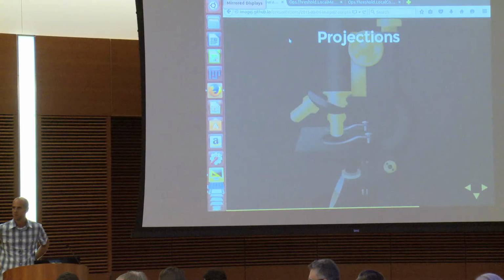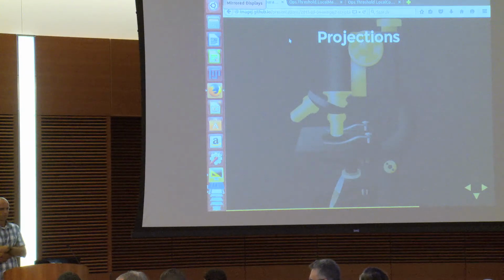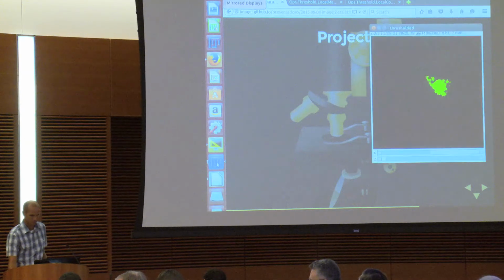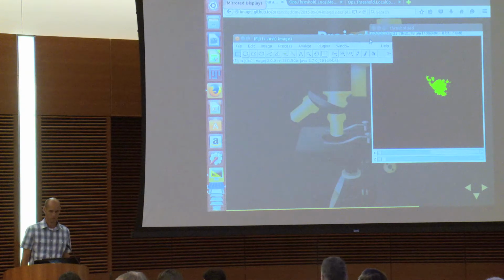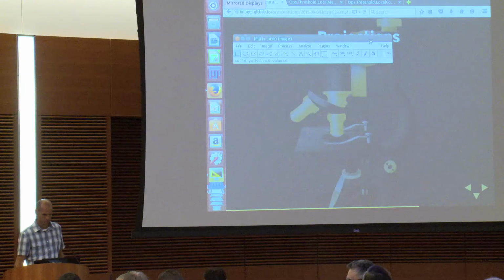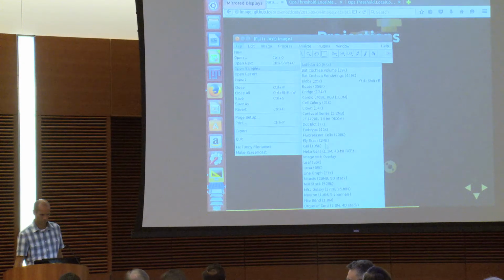The reason we're using scripting languages instead of the ImageJ macro language is because the macro language is the only thing that works differently, and it has its own set of functions that are different than the Java functions. Whereas with scripting, you can basically call any of the Java API functions, including ops. And so that's what we're doing. But ops is not exposed in the ImageJ1 macro language. There's only one way to call other stuff from the macros, and it's this command called call, which can call static methods. So it's more work.